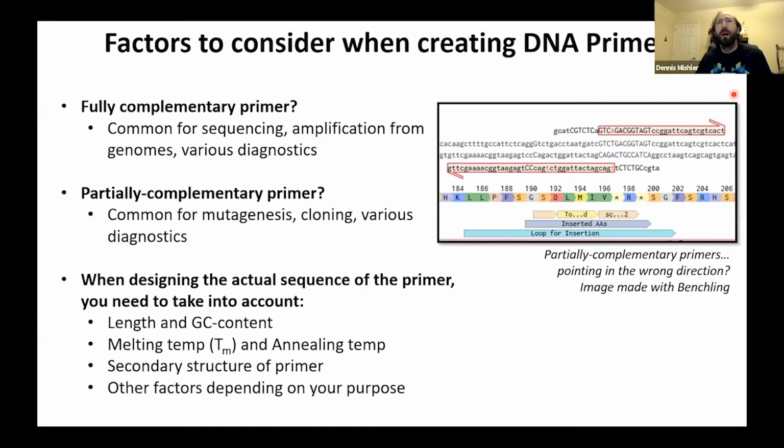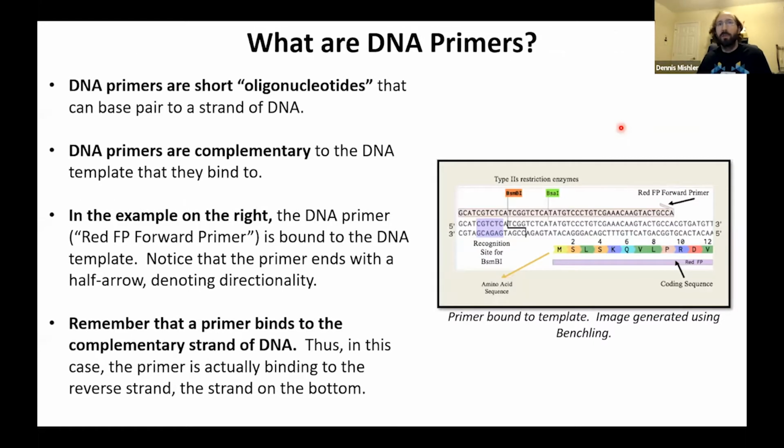Okay. In the example over here on the right, you can see we have 2 primers. And interestingly, there are 2 big differences relative to the previous example. The first difference is not all of the primer is in that red box, right? If you go back here, you can see everything was in the red box.